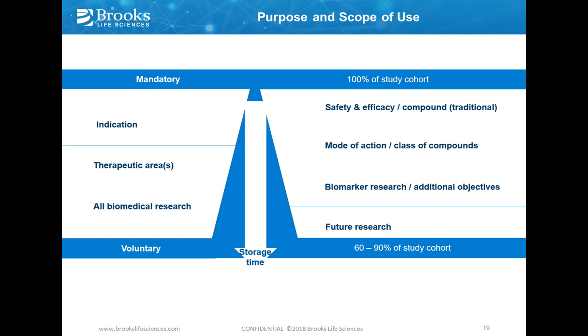There you also have the time span. Will they accept storage of 15 years or 30 years? What do I need for a storage? And depending on that, it may be mandatory or more voluntary. That means the patient or the donor of the sample has the opportunity to freely decide: I want to provide my sample for future research, or I do not want to do that.